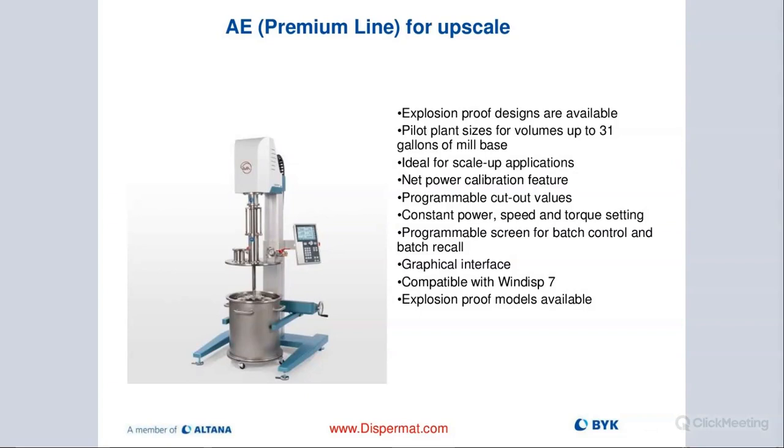And then the same threshold setting for the bottom, H2 we call it, so that when you lower it, you can't always see the exact height of the blade in the container when you have a mill base in there. So that way you stop the blade on the bottom at a certain height, so it won't ever bottom out and hit the container bottom.